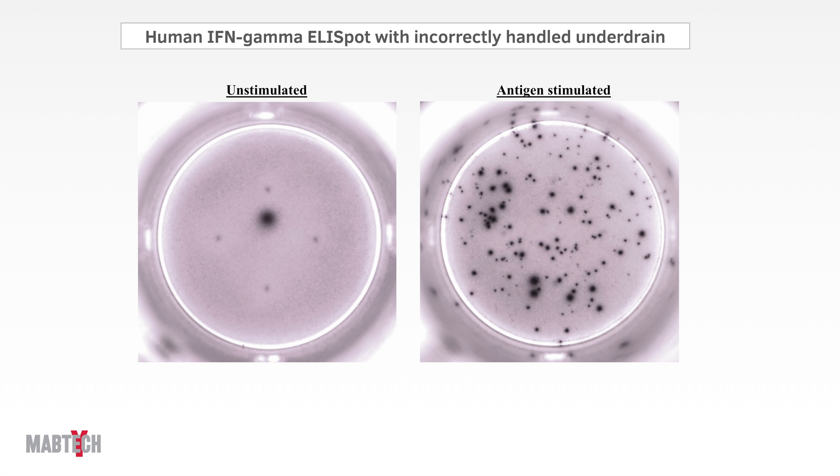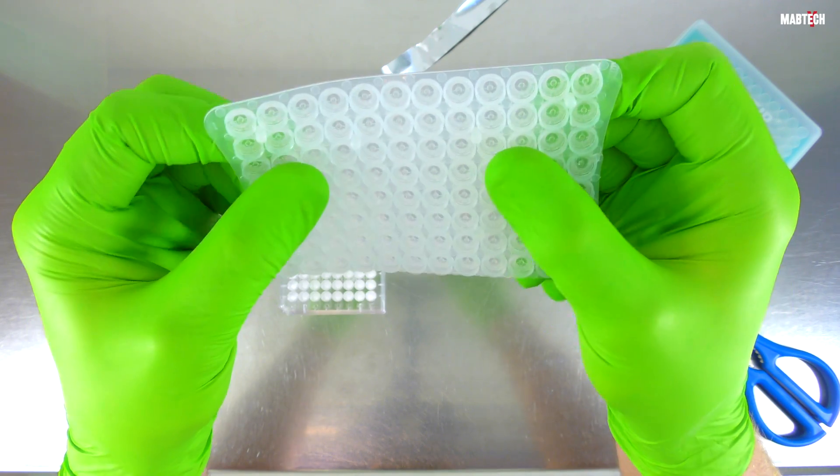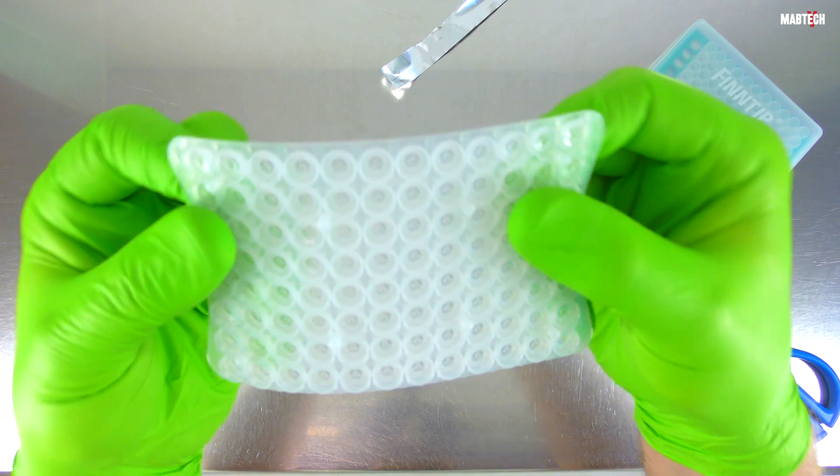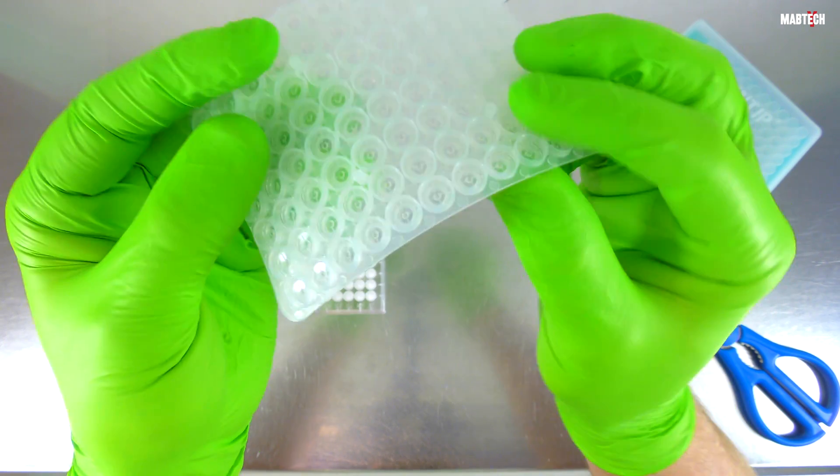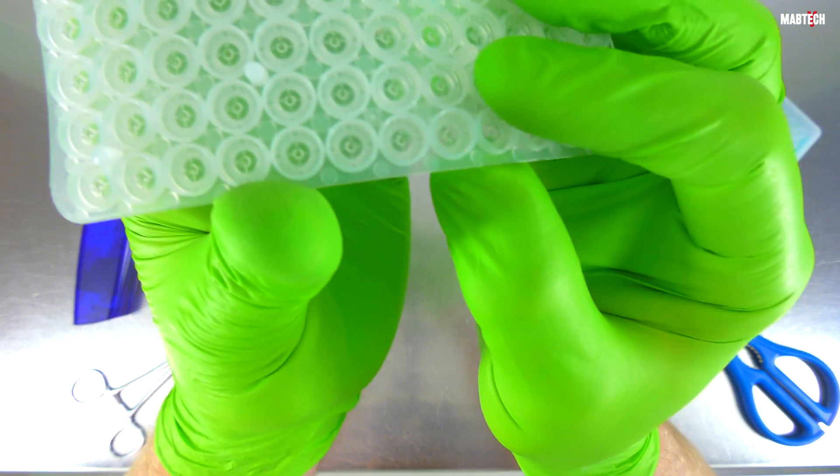One might ask, why do we get four unspecific dots from the inner structures of the underdrain? Well, let's go back to the video and inspect the removed underdrain a little bit more in detail, closer to it.